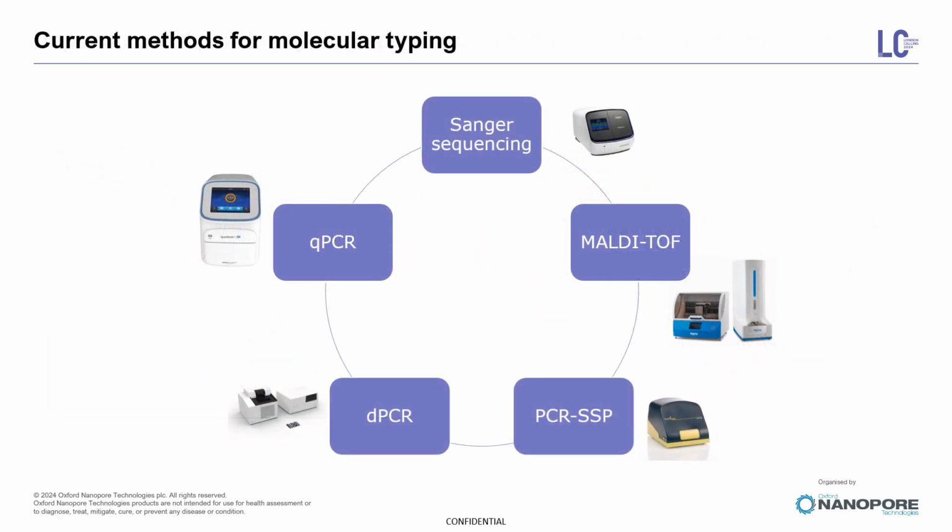Blood groups are routinely determined in blood transfusion centers through a variety of molecular and/or serological tools, like the ones listed here. While these methods are effective in determining most blood groups, they have their limitations, especially when SNVs need to be phased to the maternal or paternal allele or when dealing with hybrid alleles.